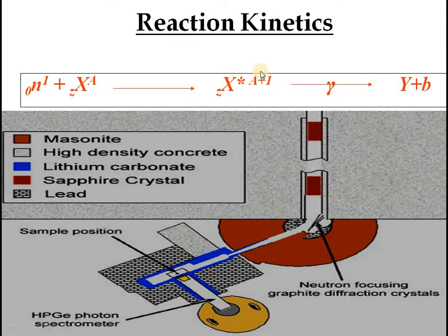That anyway depends on the property or the nature of the nucleus, resulting in the creation of certain other daughter nucleus, products, you can say. And we are concerned with the gamma. What is the energy of the gamma and how many gamma photons are emitted? Energy or the frequency will lead you to the type of target, and the number of photons will lead you to the amount of that target, how many nuclei are present.